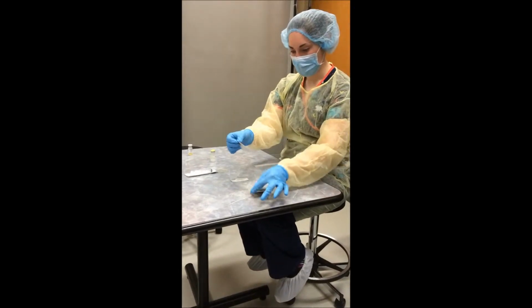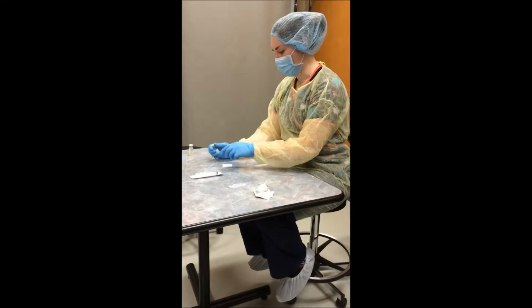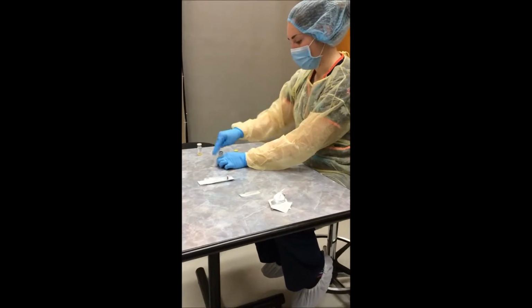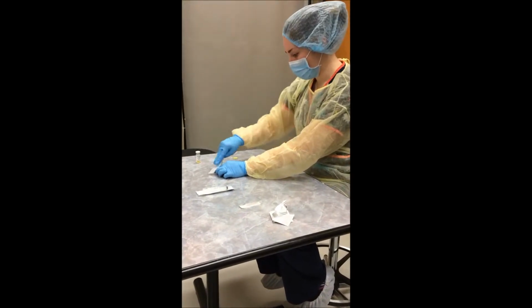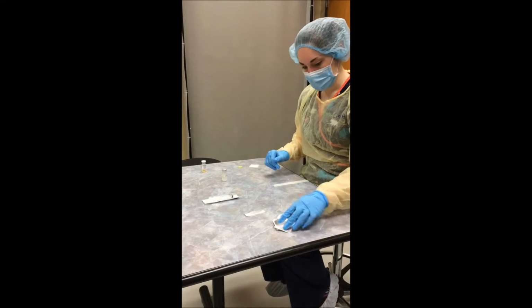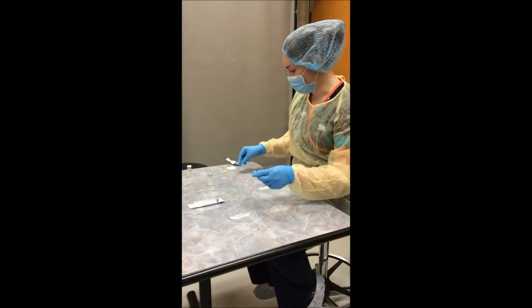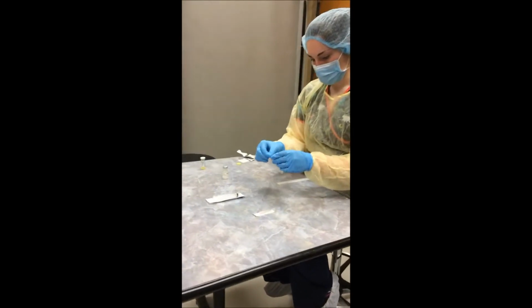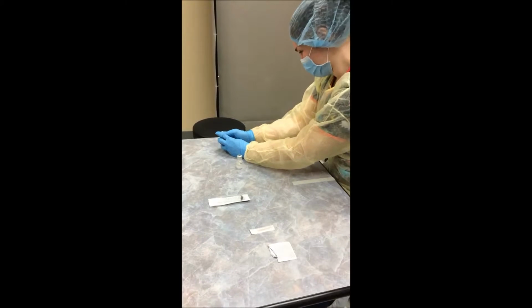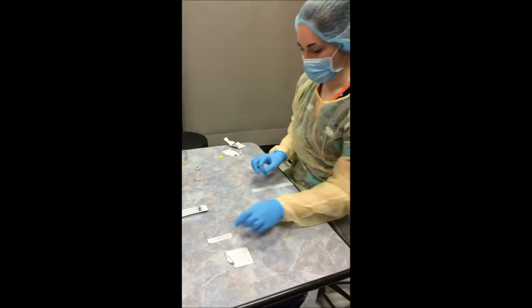So we start by ripping open our alcohol swab. We would put this over here, pop this off, wipe this down 3 swipes away from the air, and be sure we do not cross over this so that it is exposed to first air. Then move all of our trash over here. And we'll do the same for the acyclovir. That's also exposed to first air.